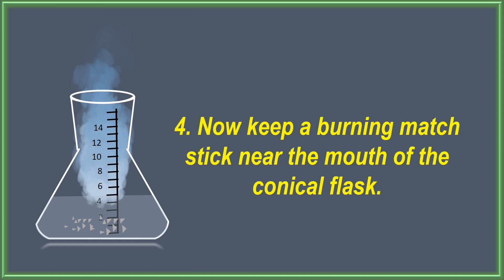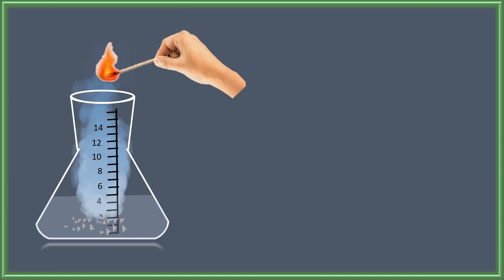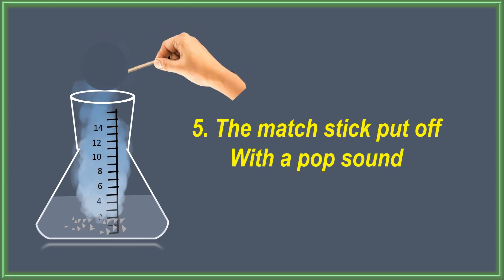Now keep a burning matchstick near the mouth of the conical flask. The matchstick puts out with a pop sound.